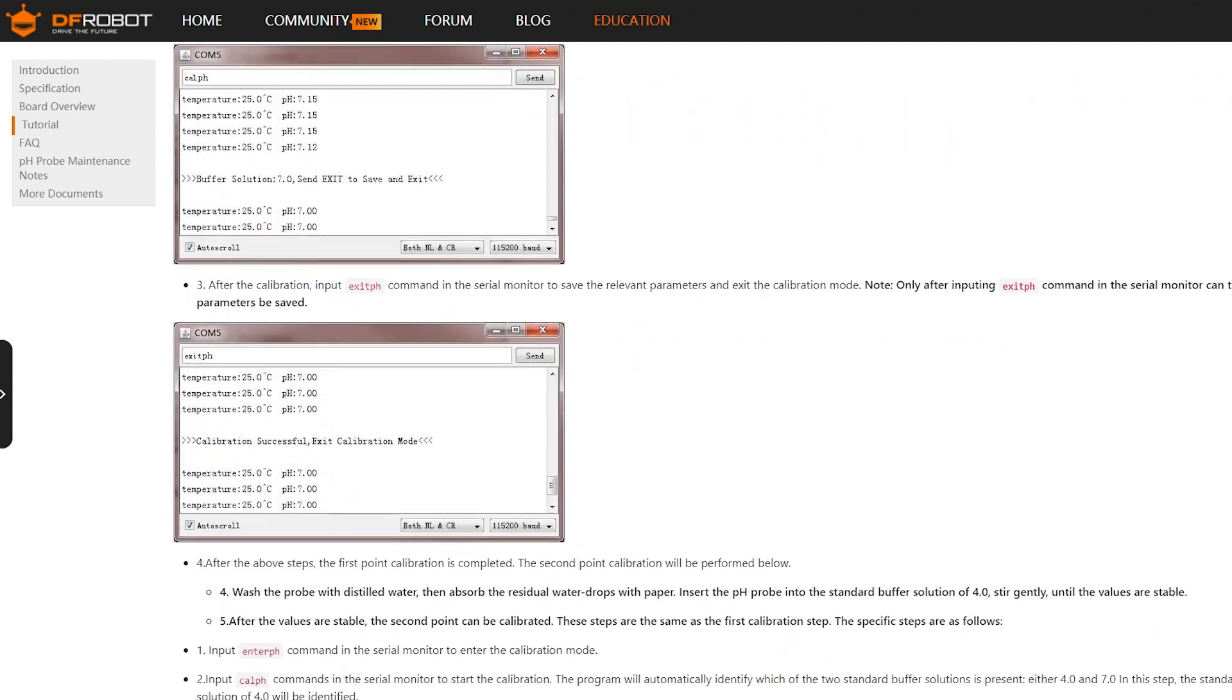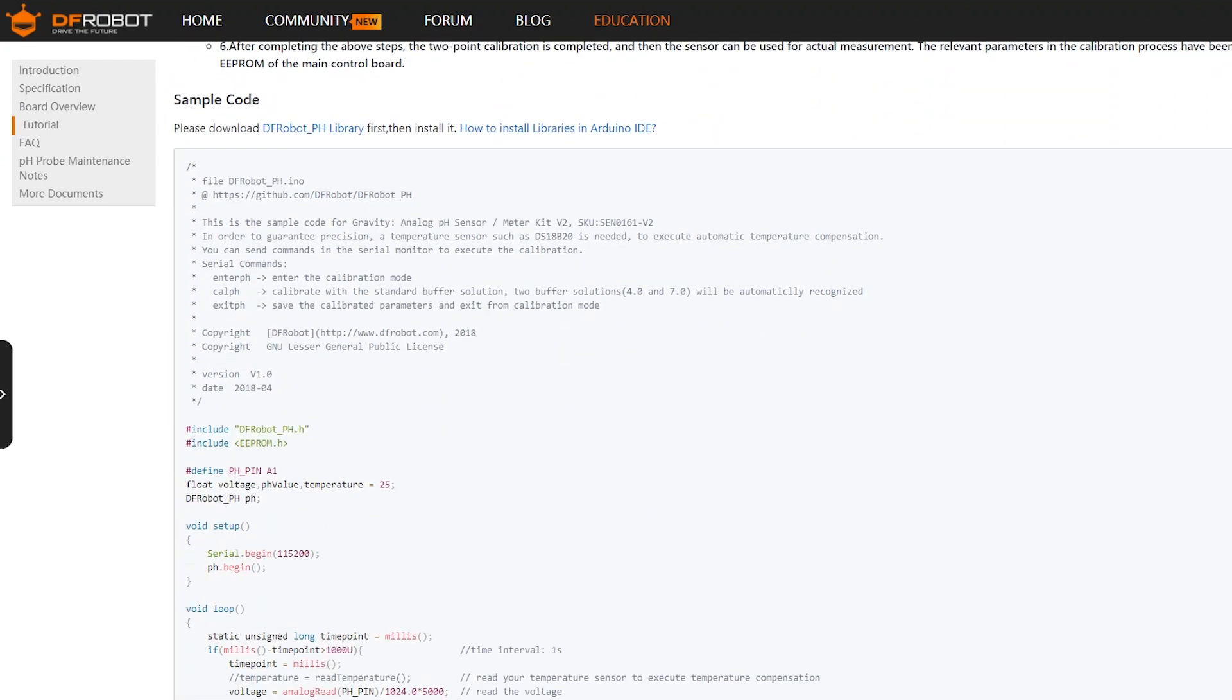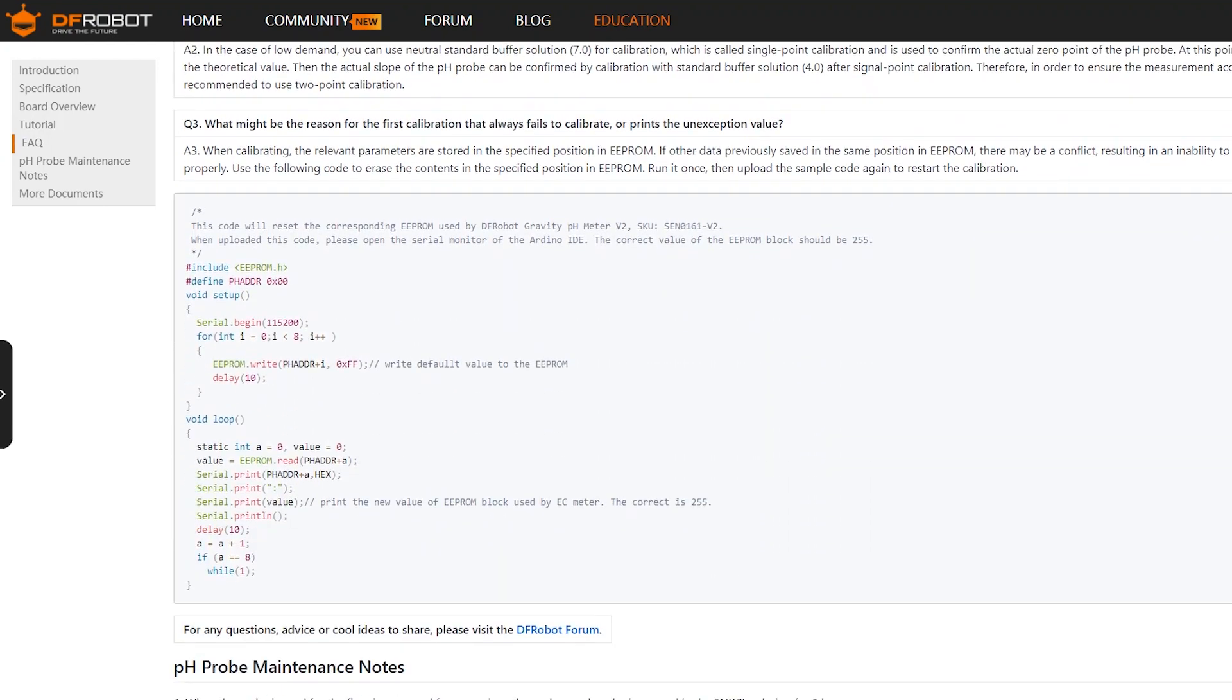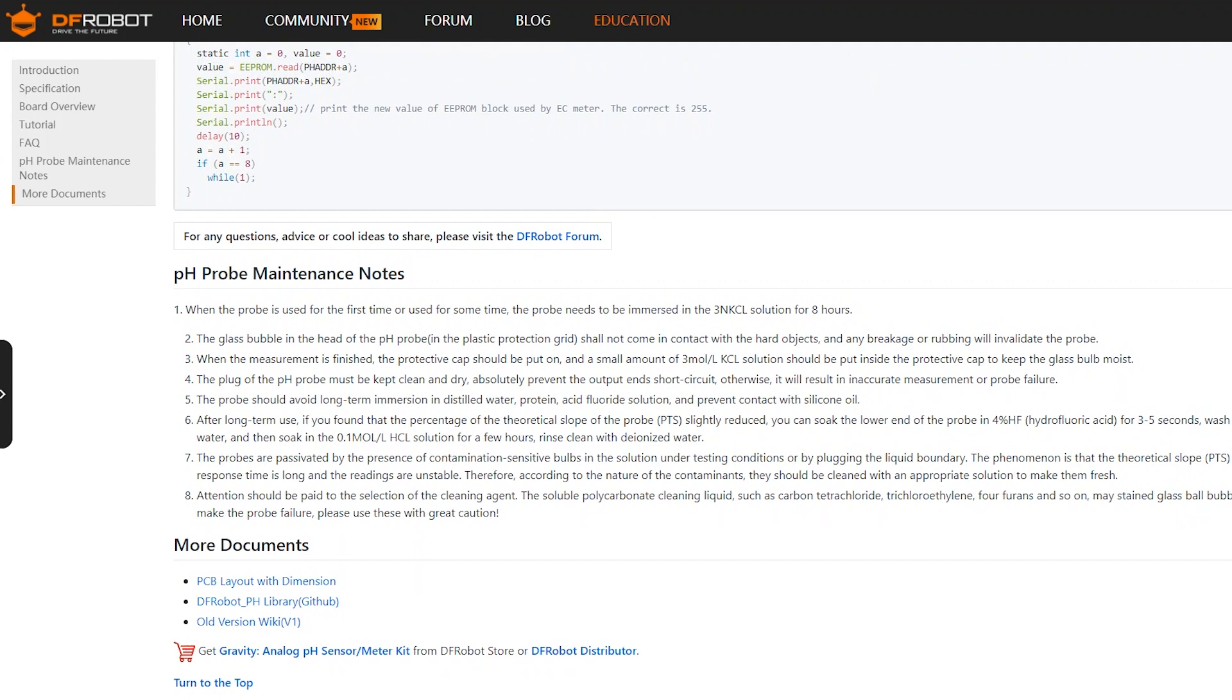For daily use, DF-robot provides the relevant open-source software library, which helps automatically identify the standard buffer solutions and perform two-point calibration quickly.